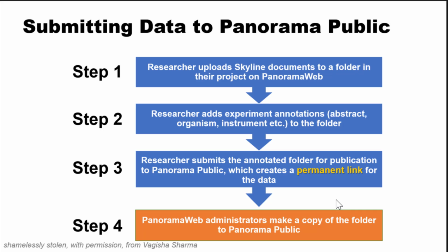How exactly does the submission from Panorama go directly to proteome exchange? So all of your raw data files are in the Panorama folder. And then when you hit submit, there are a couple of annotations that you have to do for Panorama, like the organism and the mass spectrometer that it was collected on. And then when you hit the submit button, there's an option to get assigned a proteome exchange ID. You don't have to do it. Hypothetically, this person wouldn't have to do anything. Somebody else is going to do it for you.